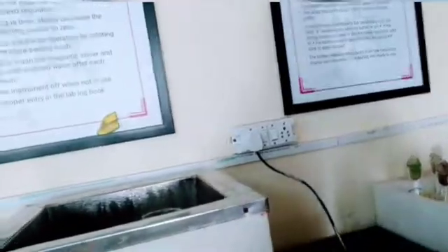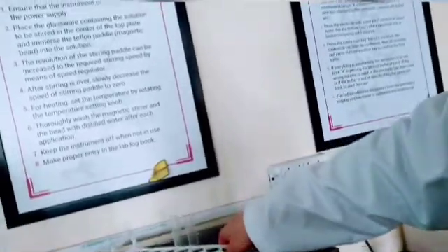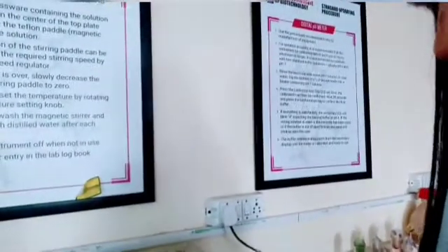These test tubes we will keep inside. There is one beaker already, so I have to get that beaker. So here inside you can see I have kept the test tubes. Now we will wait for the result, and after 2 minutes we will see the result.